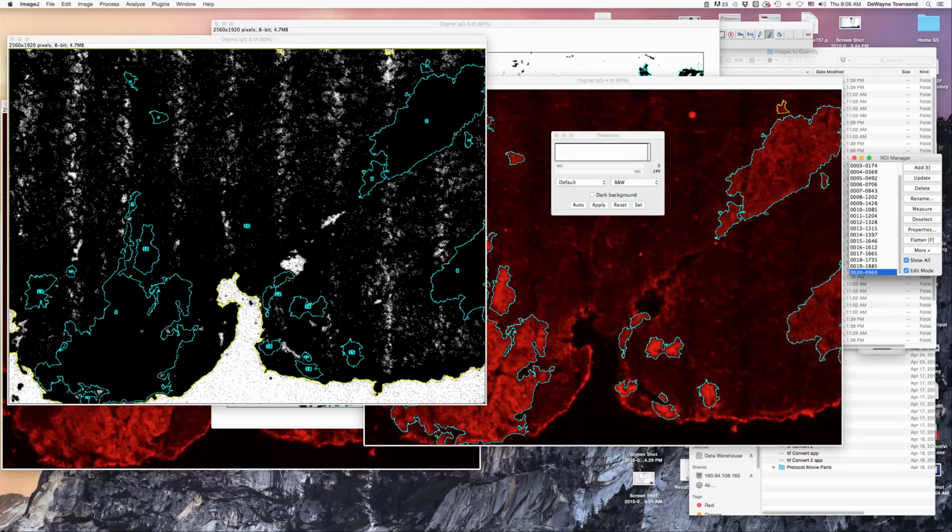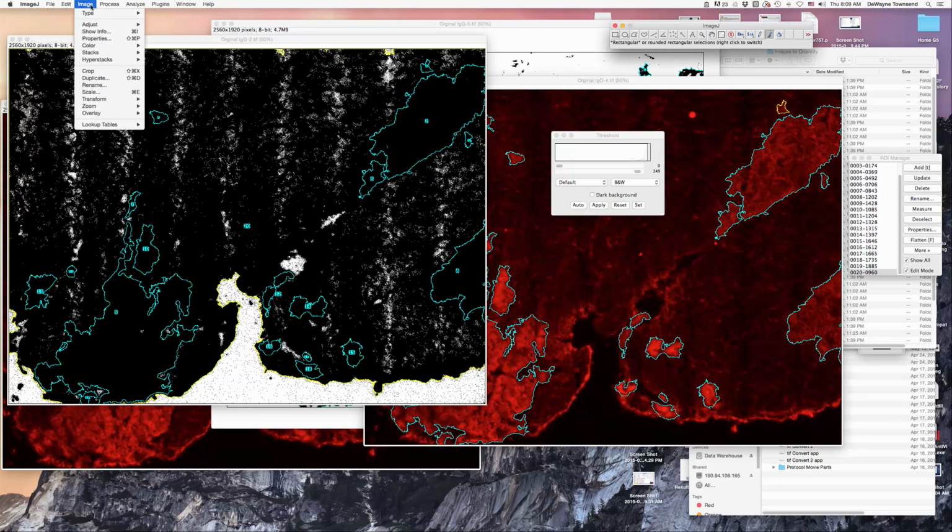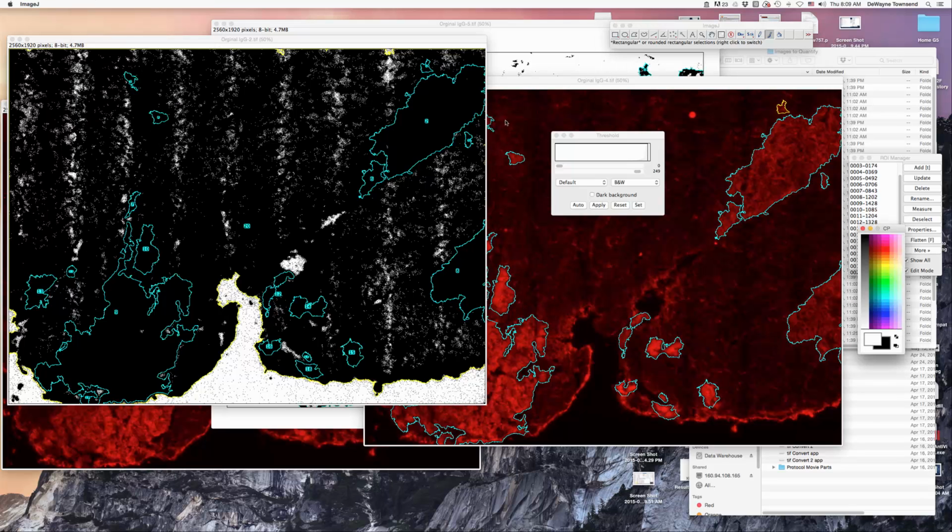It looks pretty good. It comes in here a little bit and excludes some of the muscle that we think it should include. So that's a little area of contention, and we need to deal with that. So I'm going to go back to our brush. I'm going to pull up our color picker again.